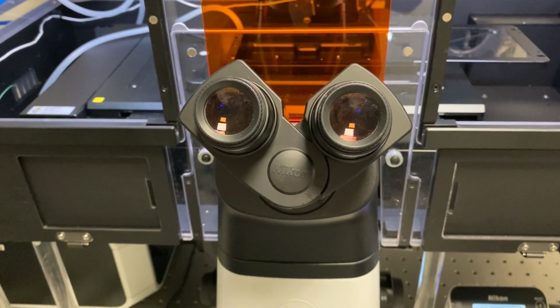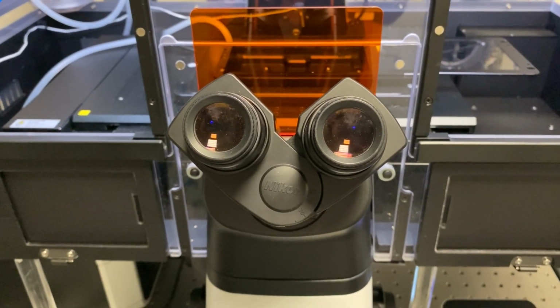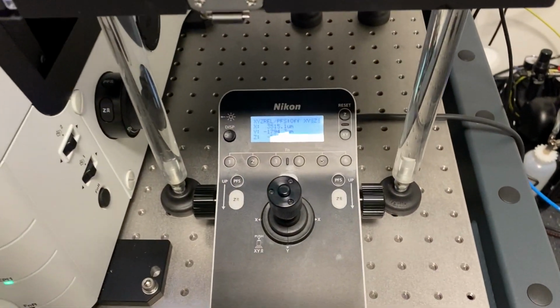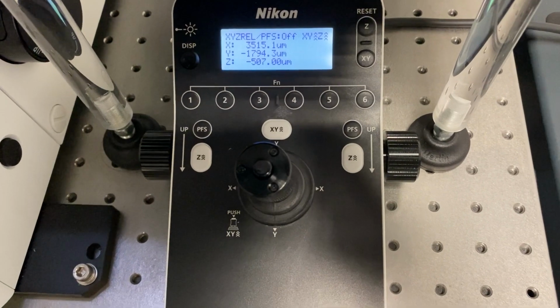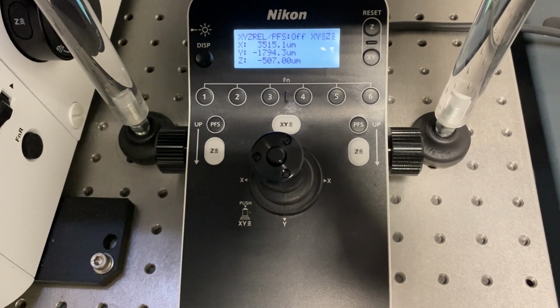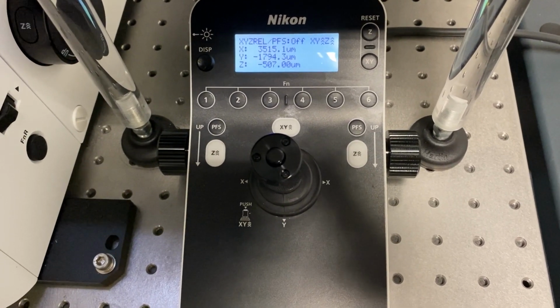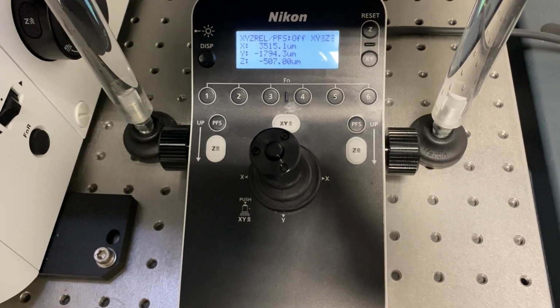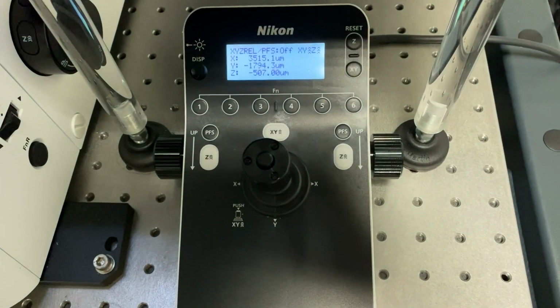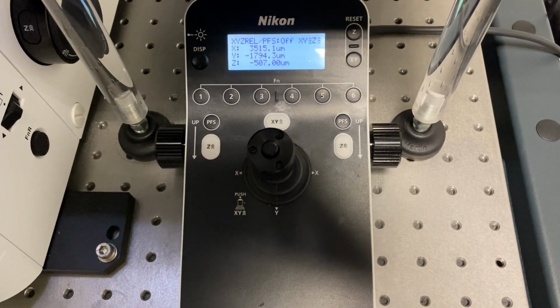If you are unsure whether the oil has touched the cover slip, you want to stop moving the wheel and step back and have a read of the Z number. If you have a decent amount of oil on there, you should come into contact between the minus 700 to minus 300 range. If you see minus 300 there or higher, it's likely that you might have just missed the oil coming into contact with your cover slip.